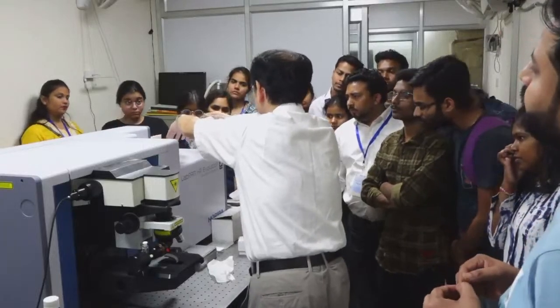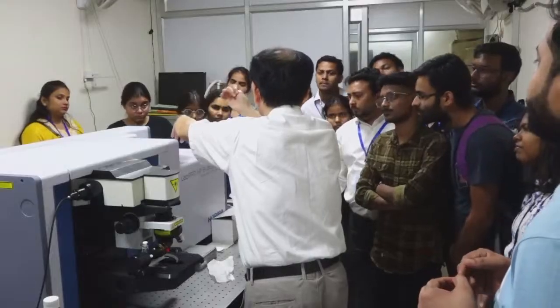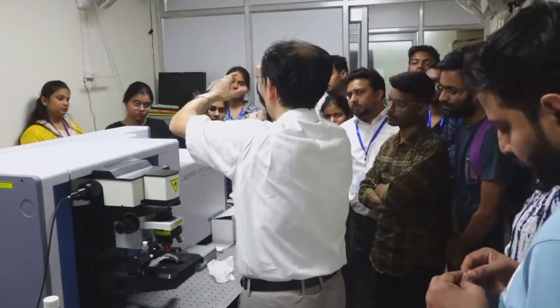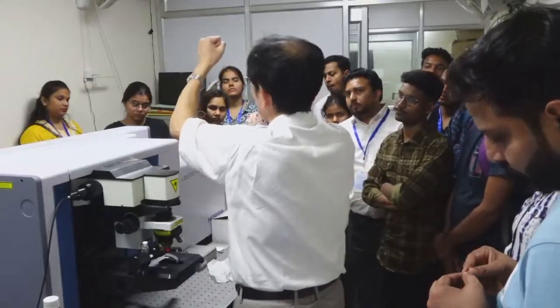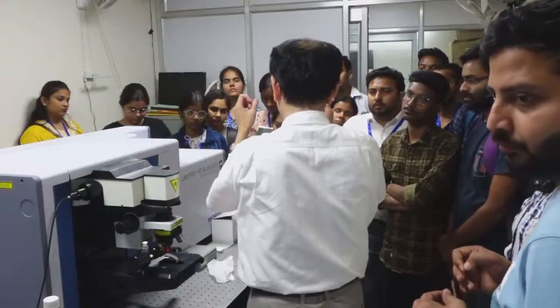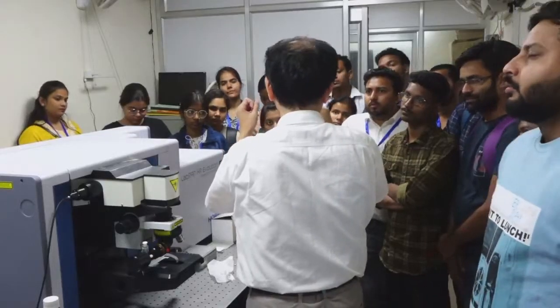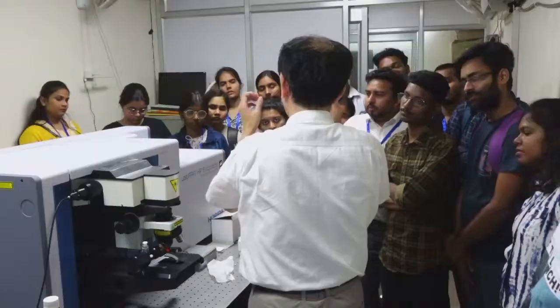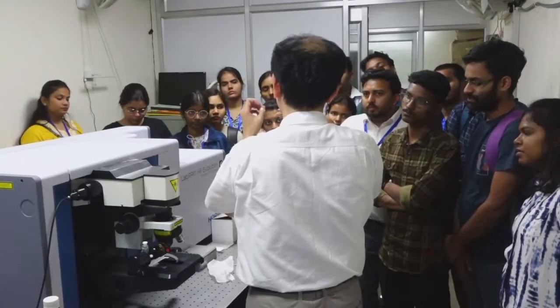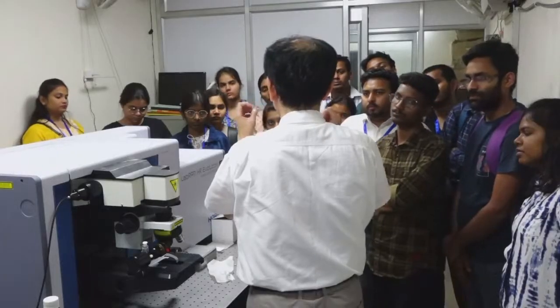CCD is the abbreviation of charge-coupled device that converts photons into electrons. So the conversion efficiency is less than 100%. The best value may be 80 or 85%. So not 100%.